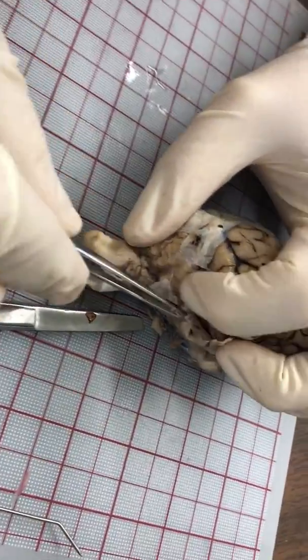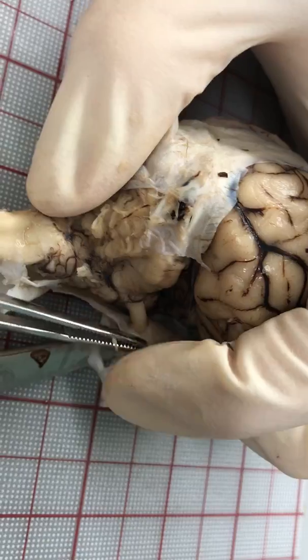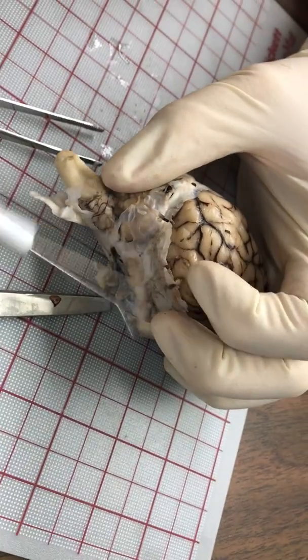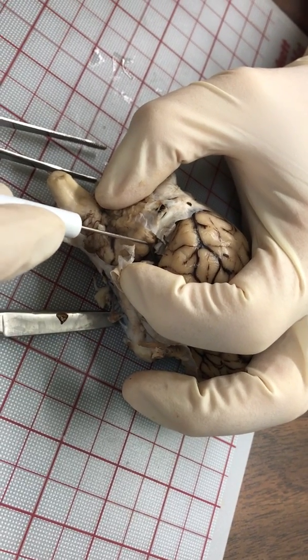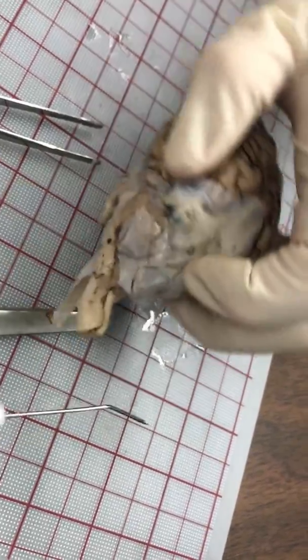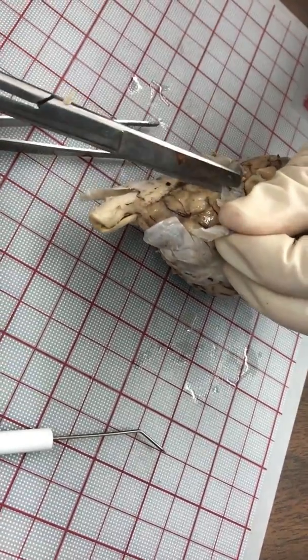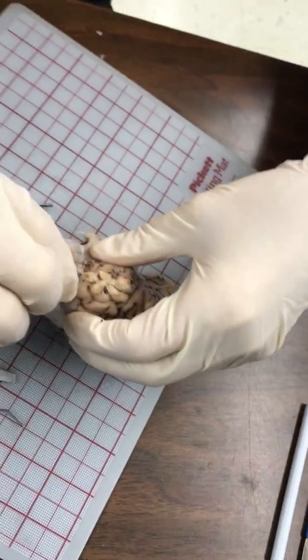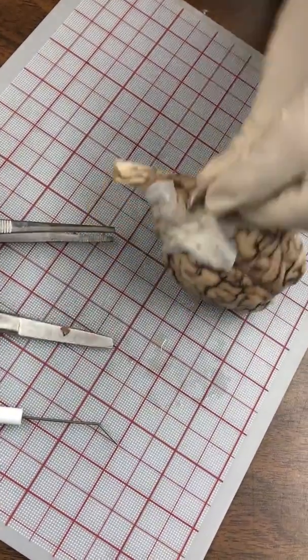I can actually see here where we have a cranial nerve going into the dura — see that cranial nerve right there? I'm going to try not to break that off. There's a little bit of dura still attached in here — I'll come back to that. I've got that one side done. Now I'm going to go to the other side and do the same thing, and then we should be able to lift the top of this dura right off.